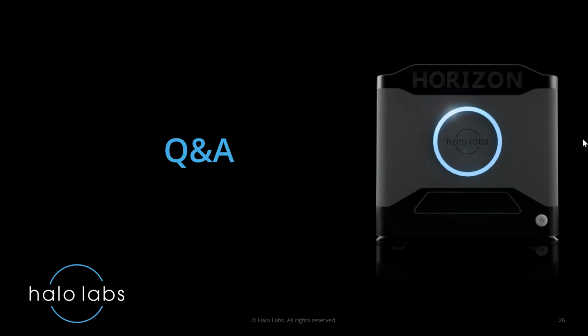Lovely. And next question here, can this method be used for pre-screening solubility? Yes, it can. It could be very expensive because some people have libraries that consist of many thousands or sometimes even millions of chemical compounds that they use to do drug discovery screening.